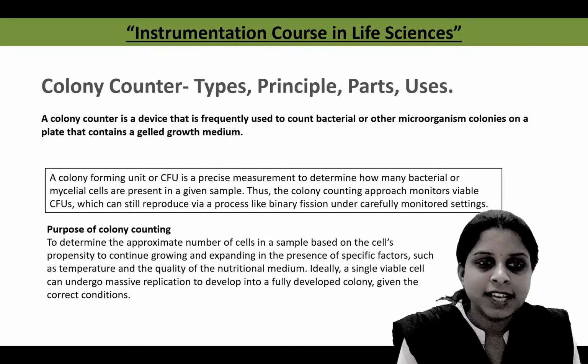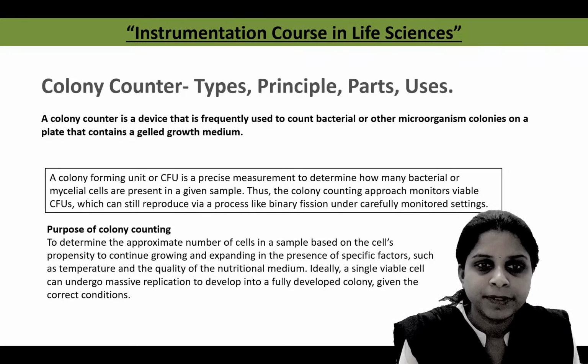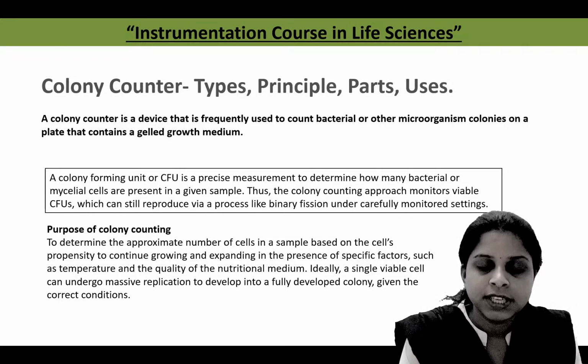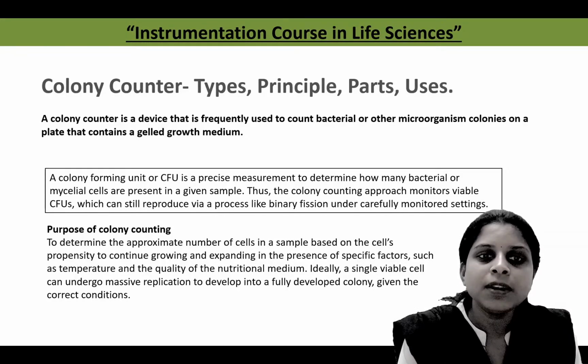I am taking the syllabus from Unit 3, which consists of instruments used in a microbiology lab. Microbiology is the branch of science that deals with the study of microorganisms. Microorganisms are those organisms which cannot be seen with the naked eye; they are seen only with the help of microscopes.